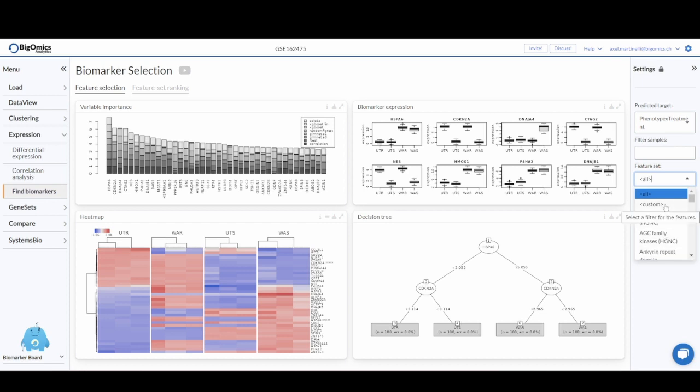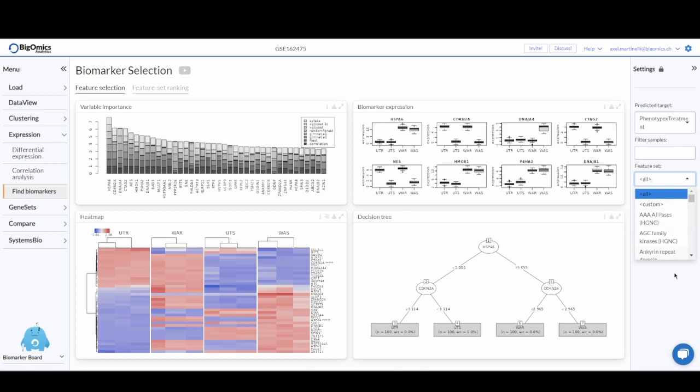You can also add a custom list of genes if you already know some potential biomarkers that you want the platform to focus on. In this case, you just click on custom and copy and paste the list of gene acronyms in a space in the platform.